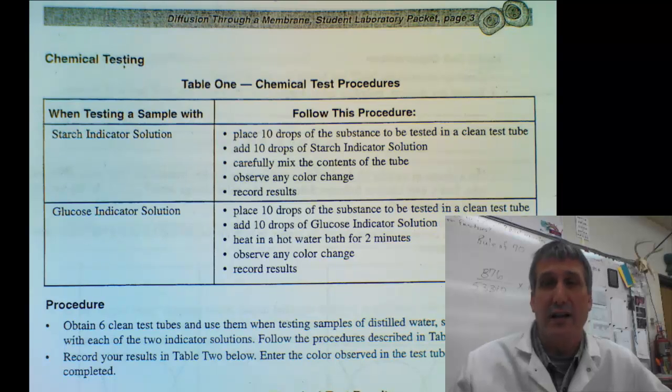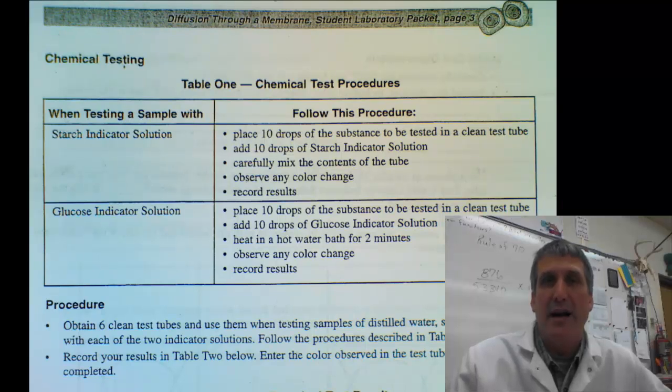We've already created our artificial cell, and now we need to work with indicators in order to determine if any of these molecules have diffused across the cell membrane in our setup.